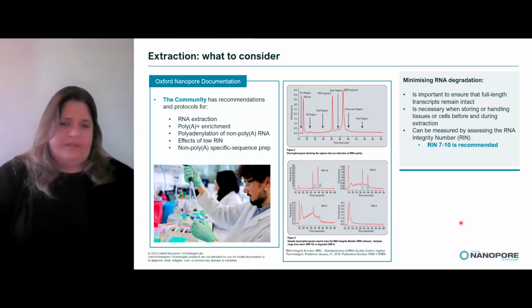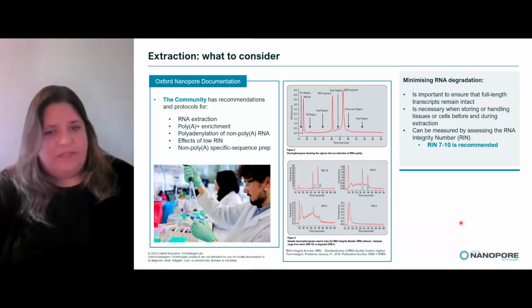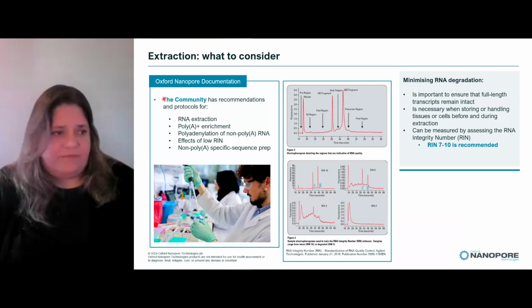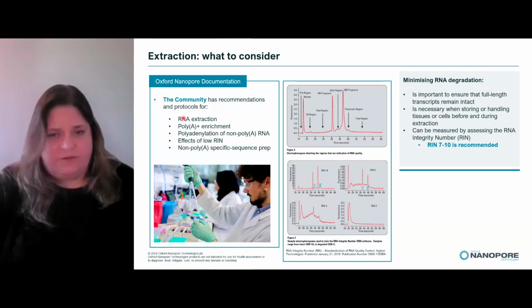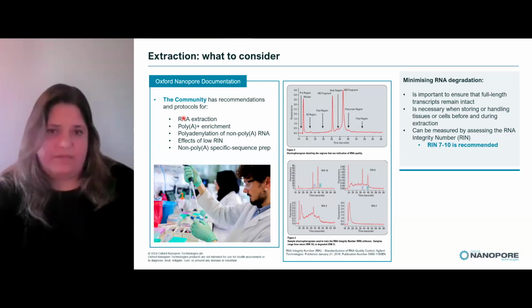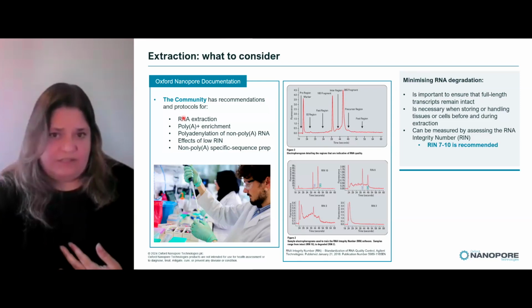We need to be very careful on how we store it and how we handle it. But the other thing we need to be focused on is extraction methods. We can introduce degradation through particular extraction methods. We at Oxford Nanopore have been working through some methodologies that we know work for us, and we have released those on the Nanopore Community.